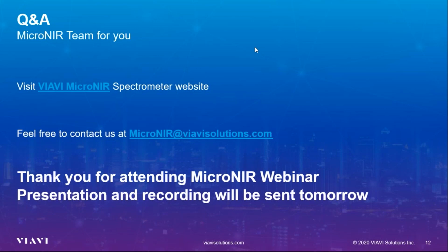Another question for you, Cristina: is it always necessary to use the PCA, or is the moving block enough? It is not necessary to use PCA. For example, if you have a binary mixture, as in my case, I can apply PCA, but I don't really get interesting information from PCA.